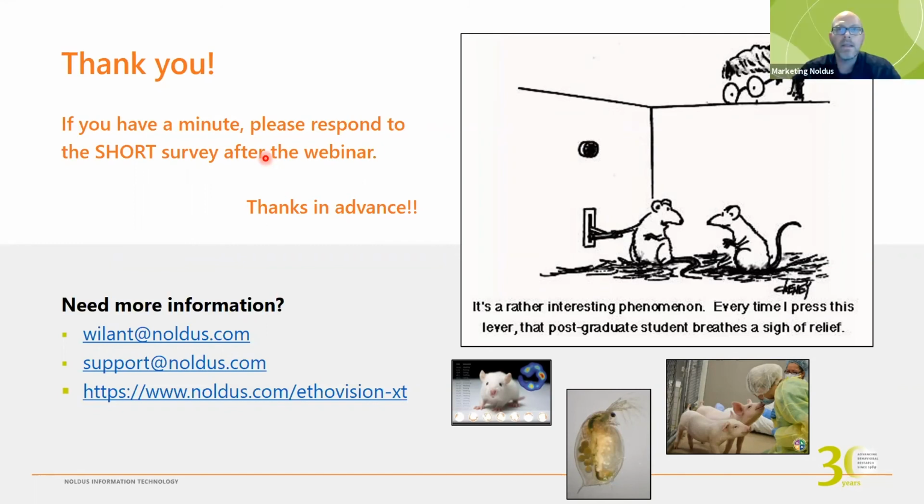I know in the analysis profile, if you select distance traveled and then you select the statistics, you can get the number of samples. And so then it will also give you the number of samples collected as well. Exactly. Okay, one more question, then the question and answer.